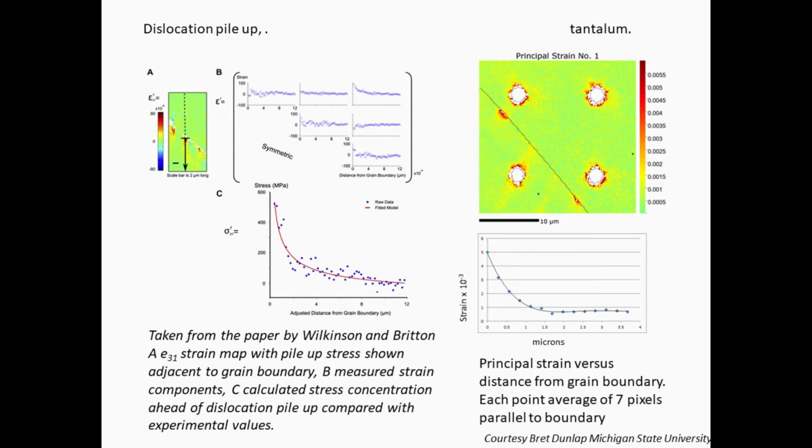This is given to us by Brett Dunlop, for which we're very grateful. As I said before, on the HR-EBSD map we saw something going on at this boundary here and that boundary here, but not there.